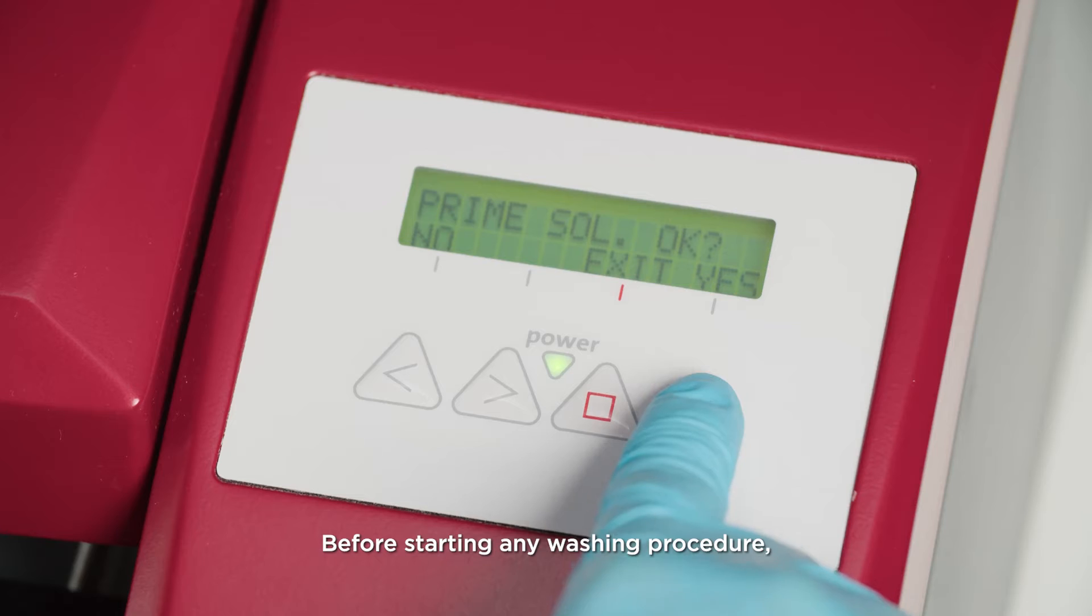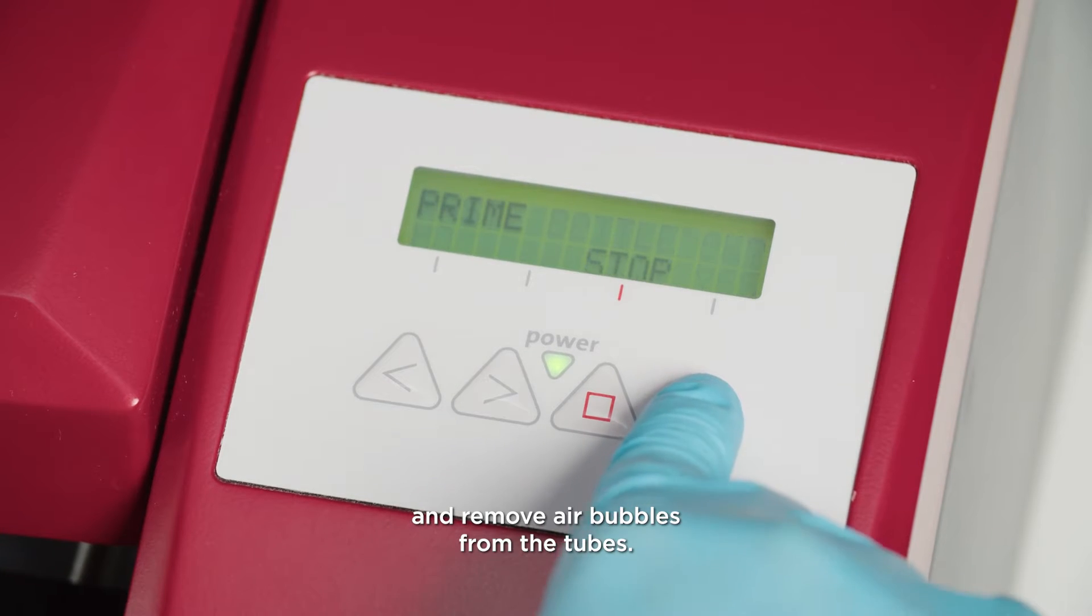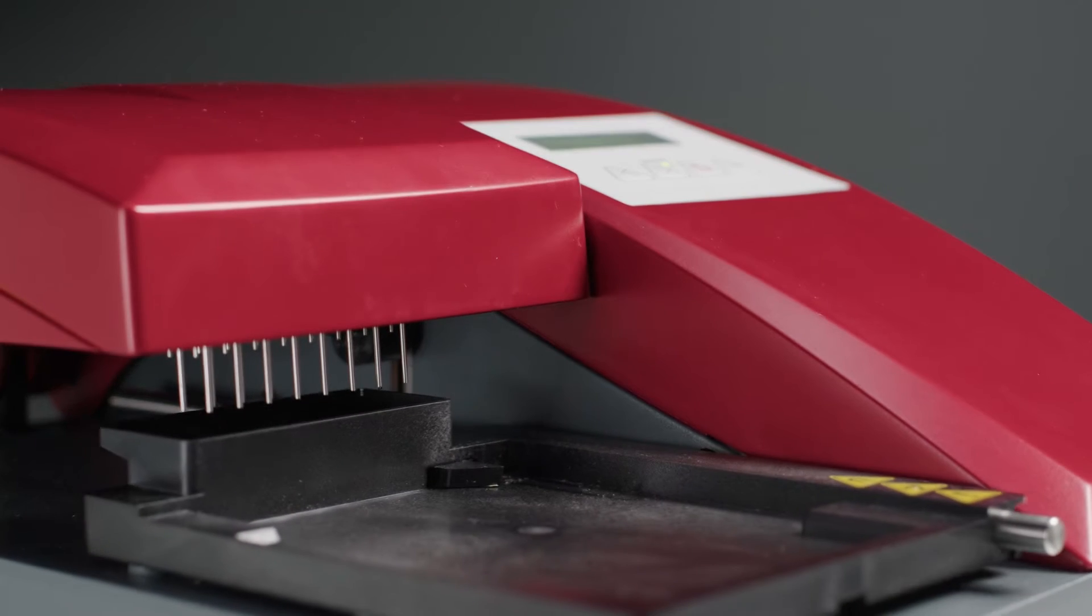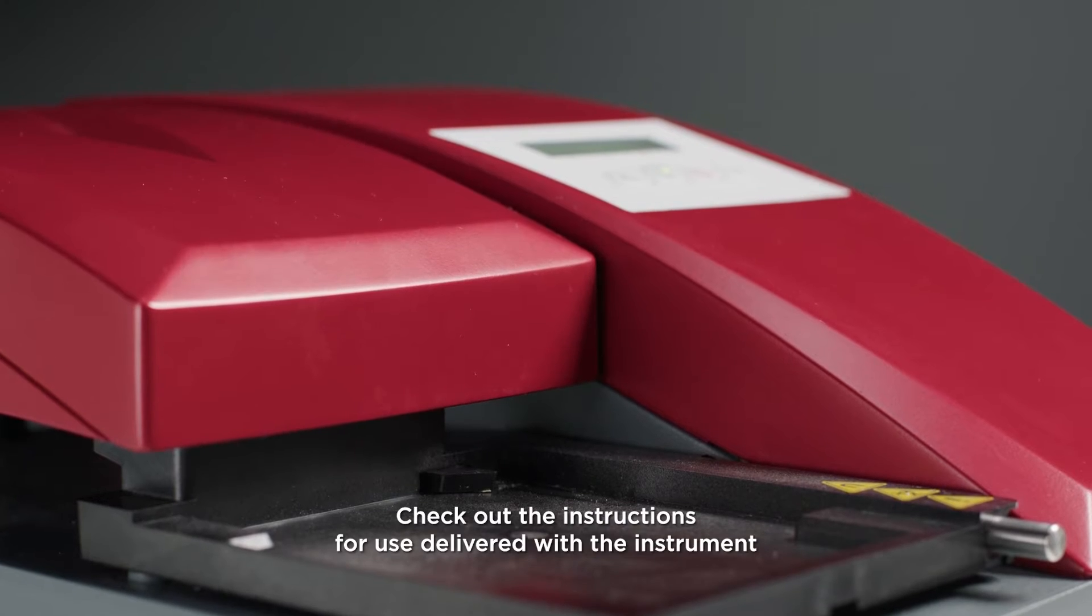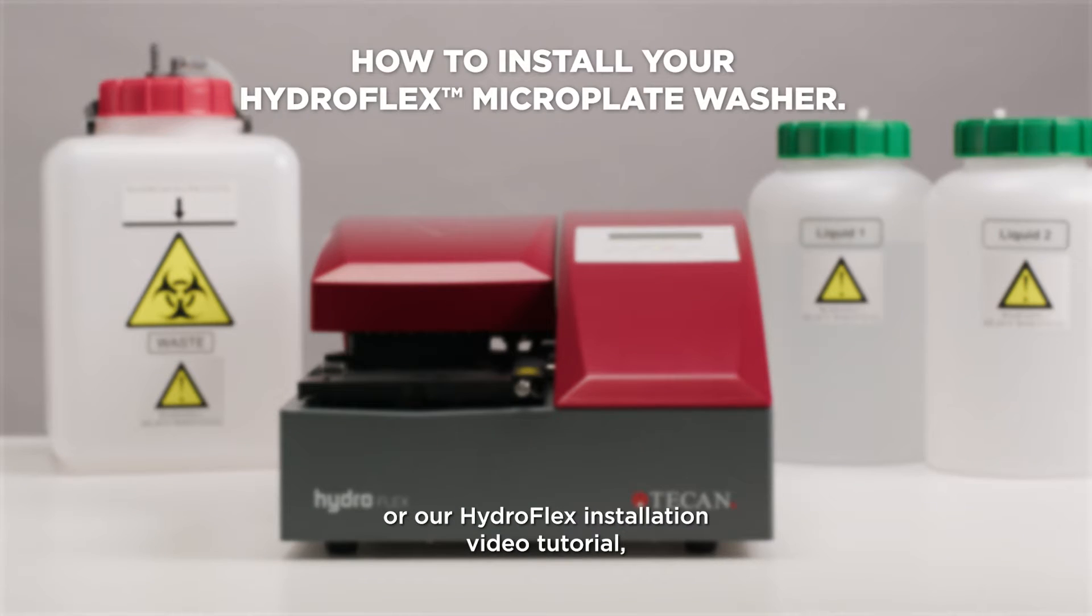Before starting any washing procedure, perform a prime procedure to fill the system with liquid and remove air bubbles from the tubes. Check out the instructions for use delivered with the instrument or our HydroFlex installation video tutorial if you do not know how to start a priming procedure.